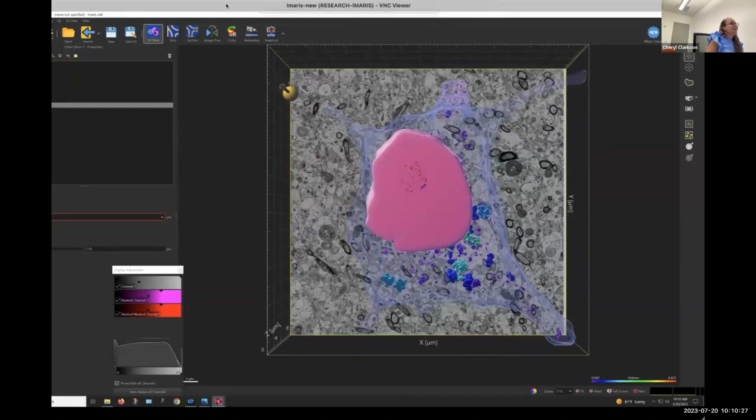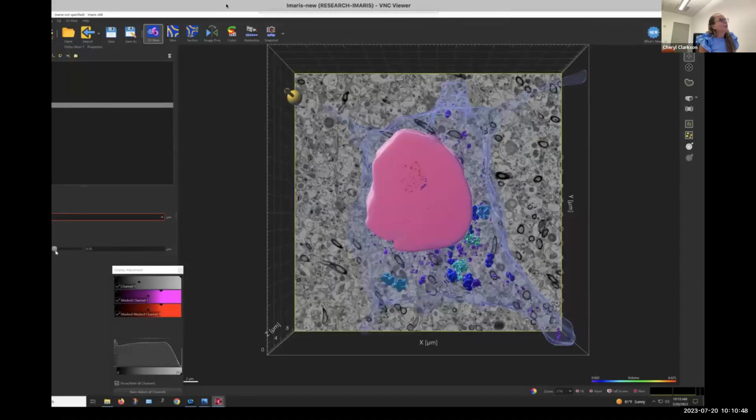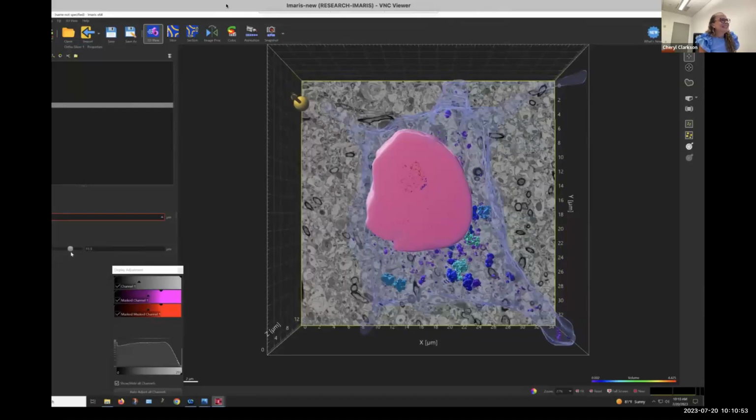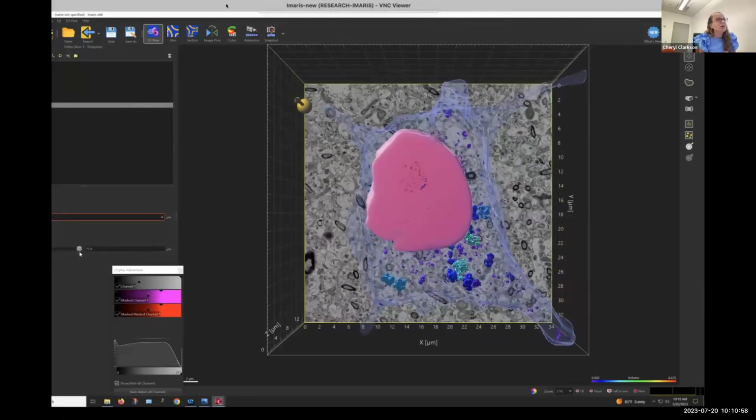After that, we can analyze section by section. We can quantify everything. If you are looking for changes in the volume of the mitochondria, in the polarization of the mitochondria, or if you are looking at things like the pore membrane, nuclear pore membranes, you can check everything with these kinds of approaches. For us it's a little bit easier, but it takes time. At the end, everything is possible, even running immunos, because in this case we also ran immunos.